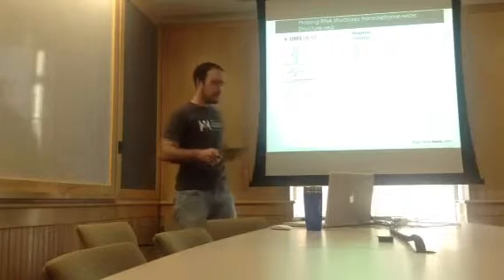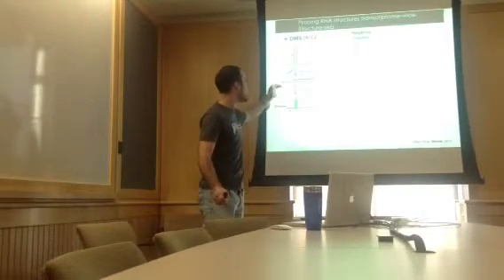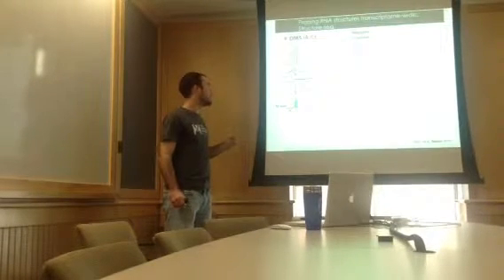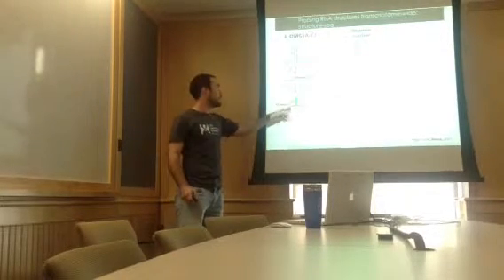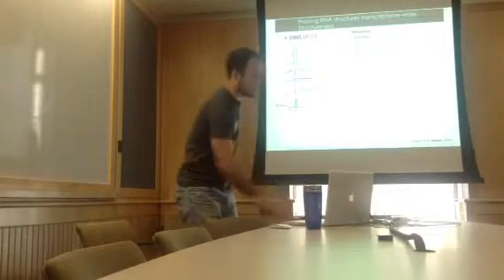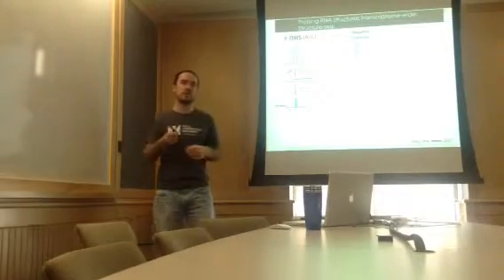So we extend, and the RT will stop at modification sites, and when we prepare the library and send it for deep sequencing, we're able to map those modification sites. And here you have, for example, the C. And we do the same thing for the negative control because there are 3 reasons why the RT can drop off.